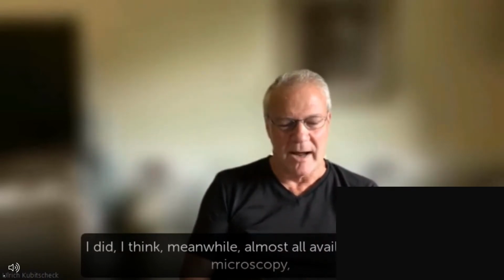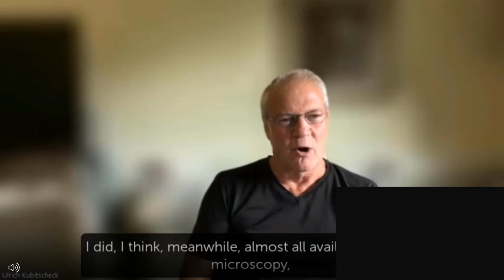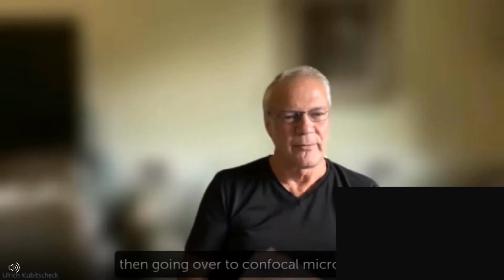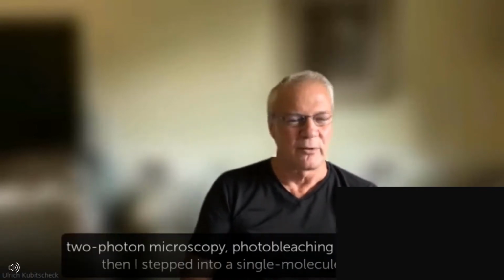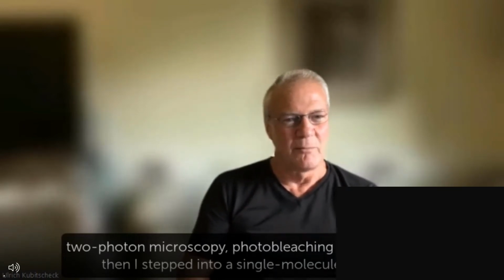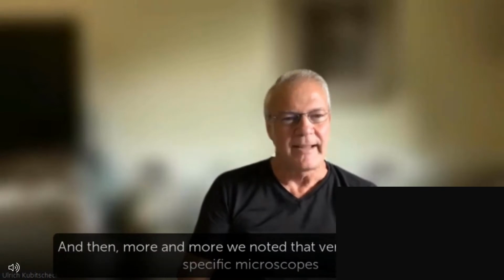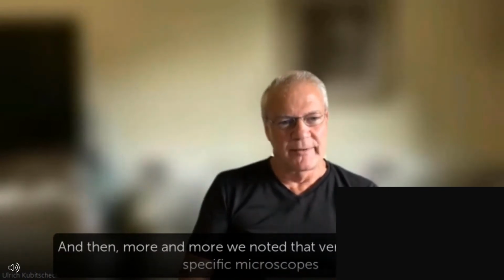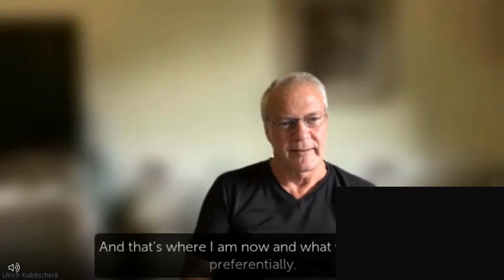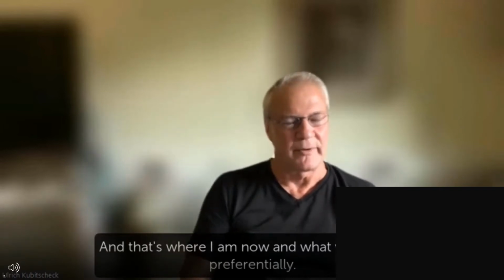I think meanwhile, almost all available types of microscopy, starting out with plain fluorescence microscopy, then going over to confocal microscopy, two-photon microscopy, photobleaching techniques, and then I stepped into single molecule imaging. And then more and more we noted that very often you need specific microscopes to answer specific biological questions. And that's where I am now and what we do now preferentially.